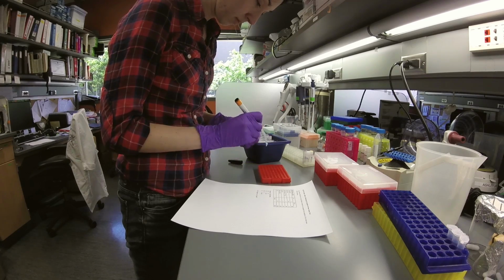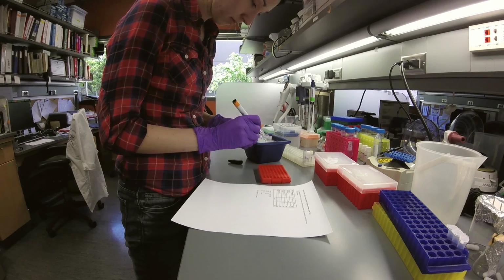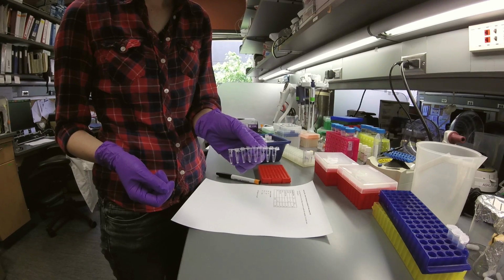Then once I get to the bench, I think of all of the different tubes that I'm going to need and I label them first. Clearly, before anything else happens. There is never a liquid going into an unlabeled tube. That is a route to disaster. You think, oh, I'll remember what's in this. No, you won't. You won't, past Alex. You will not remember what's in that tube.